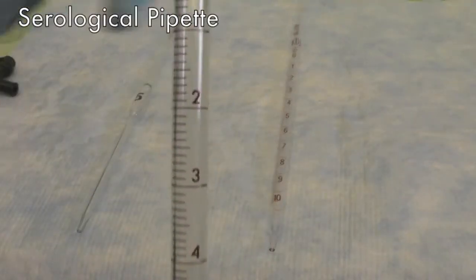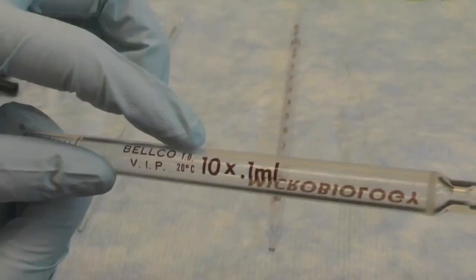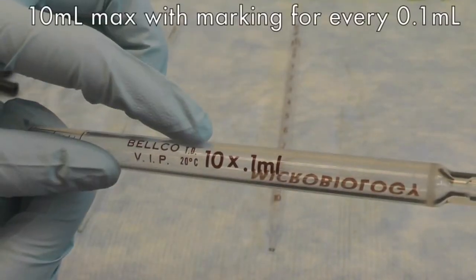Serological pipette is graduated to dispense different volumes. The number at the top of the pipette shows the maximum volume that can be accurately transferred by the pipette. For instance, this pipette can transfer a maximum of 10 milliliters, with accuracy up to 0.1 milliliters.